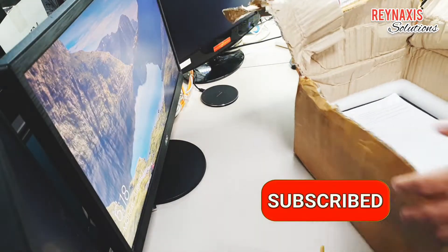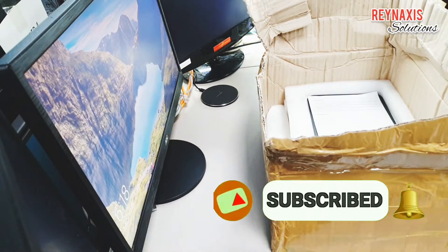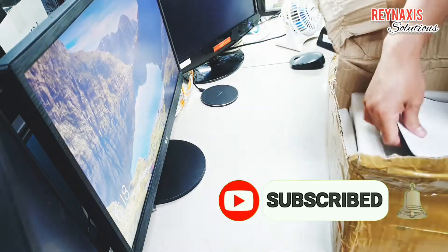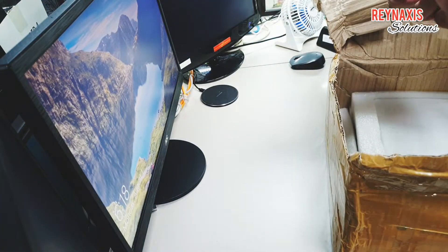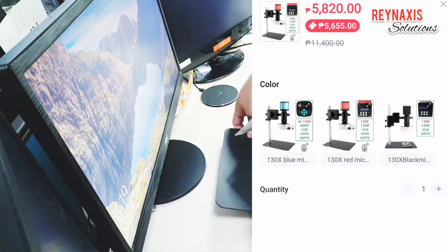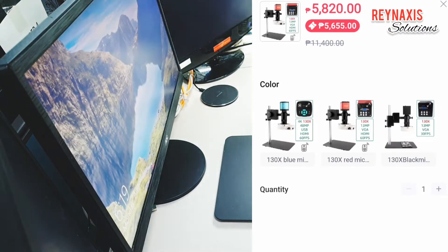Hi, I'm Glenn of Rain Access Solutions. Welcome to my vlog. On this episode of Rain Access Solutions, I'm going to unbox a Kuaiku or IIZAN digital microscope that I got from Lazada.